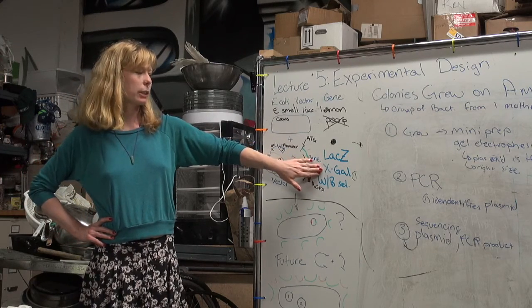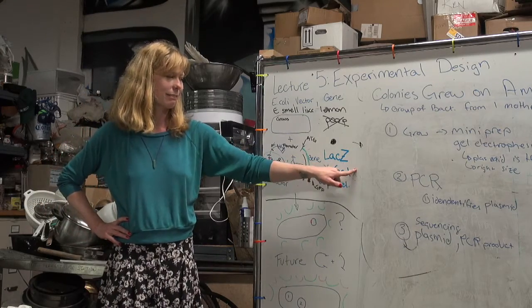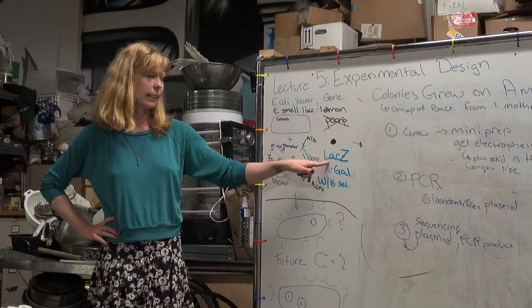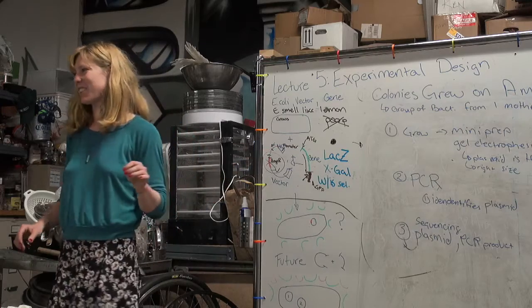So it should not naturally make blue when plated on X-Gal. You want to make sure that that's not happening. But I can't tell clearly, I have to look to see what the difference is. I'm not sure.